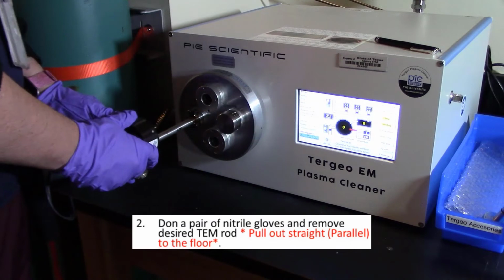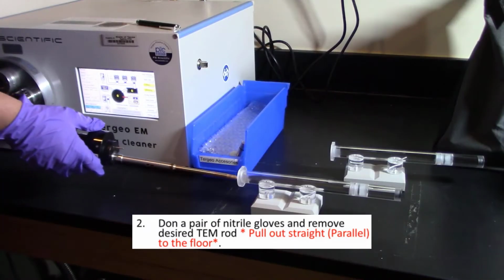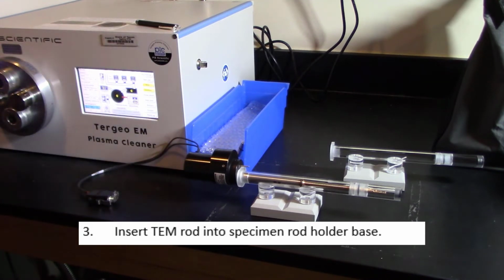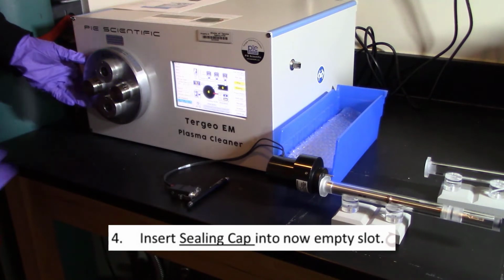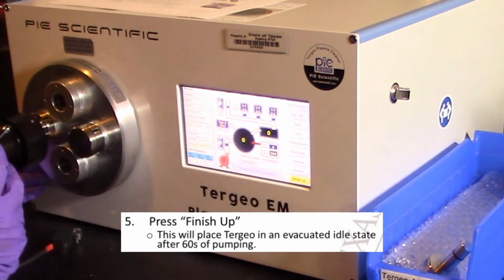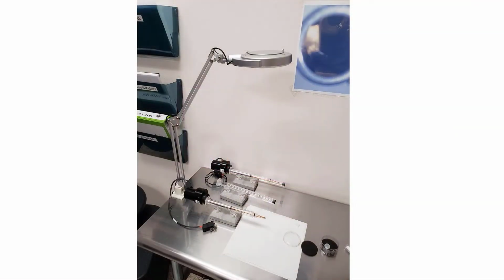Don a pair of nitrile gloves and remove the desired TEM rod. Pull out straight, parallel to the floor, and insert the TEM rod into the specimen rod holder base. Insert the sealing cap into the now empty slot on the Tergeo. Select Finish Up. This will place the Tergeo in an evacuated standby state after 60 seconds of pumping. Carefully take your freshly cleaned specimen rod in the specimen rod holder base back to the TEM sample prep area.